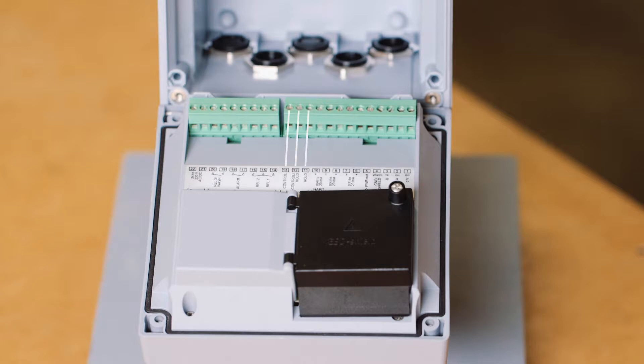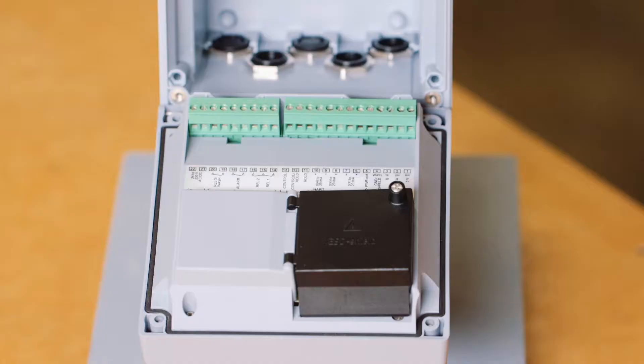Next are the digital inputs. The digital inputs can be used to monitor flow, change parameter sets within the transmitter, or place the transmitter into hold mode. Hold mode simply holds the transmitter output to a desired setting programmed by the user. There are also two 4 to 20 milliamp outputs, the first of which carries the HART protocol, and a 4 to 20 milliamp input for an external temperature sensor.